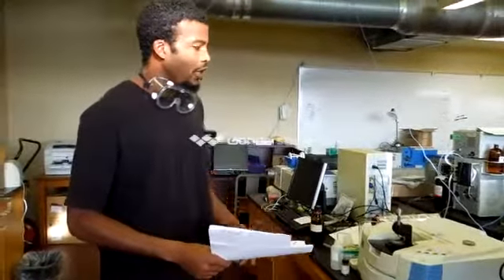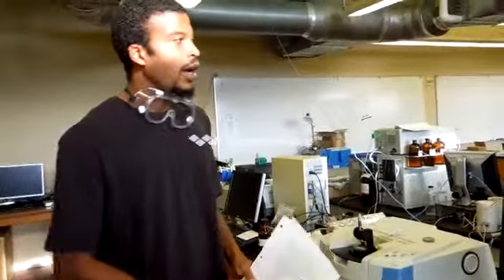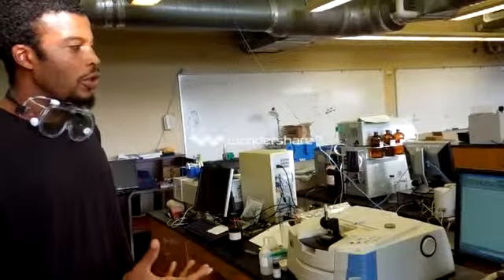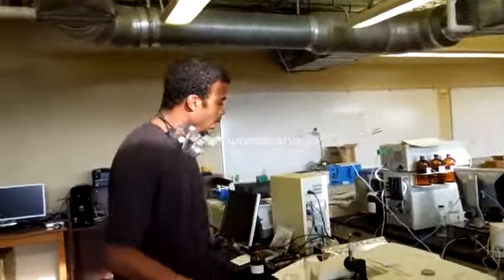Let me show you an example of actually running an IR here. We have an IR machine here, and usually you would have to collect the background, sort of like tearing a scale when you go to weigh something. It takes out all the background light and anything that's in your environment, so it doesn't show up on your spectrum. We don't have to do that today.